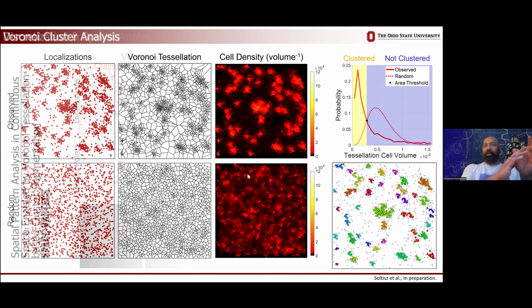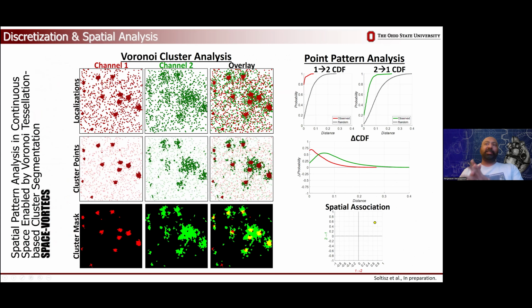And the whole point of doing all this is so we can turn this unsolved problem into a previously solved problem. This is another principle that I deeply believe in. We took all this continuous space data, generated density maps and cluster maps using tessellation, and once we're there, we can easily discretize those without loss of information, turn it into pixels or voxels, and then put it into that pipeline we previously built. Why would I do something new if I already have a good tool for that?